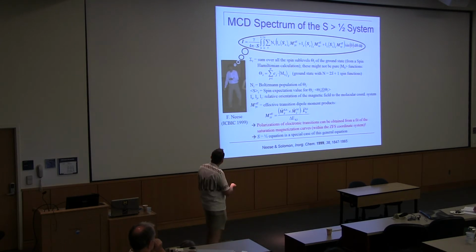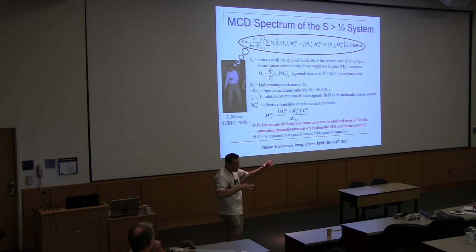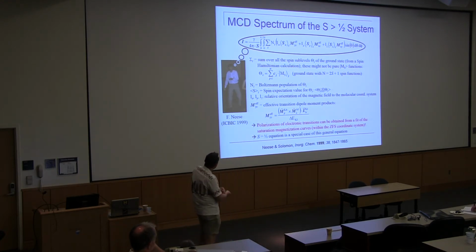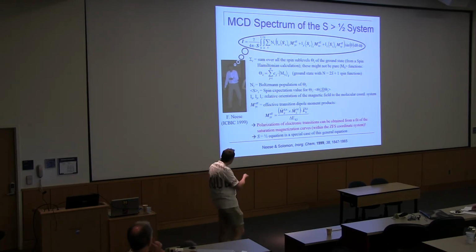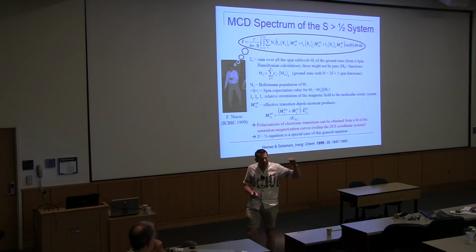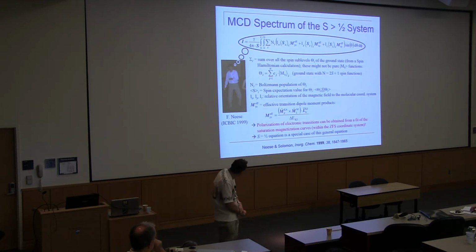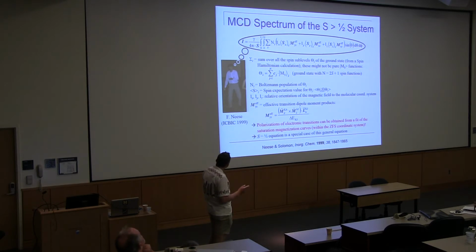And then what we also have in there now is a spin expectation value, and that's of course how this again connects to magnetism, right? So you have the sublevels, you have the energies, the population, and then you have spin expectation values for all of them. But you can see it's a conglomerate again. So the intensity that we measure certainly depends on this, but it also depends on spin-orbit coupling. It also depends on the transition dipole matrix elements, and so that's again why from the absolute intensity that we measure, we can't say what the total spin is, compared to a magnetic susceptibility measurement. So we can only normalize to a maximum intensity of 1 and then look at the shapes of the curves and simulate those. And then we can also derive something else.